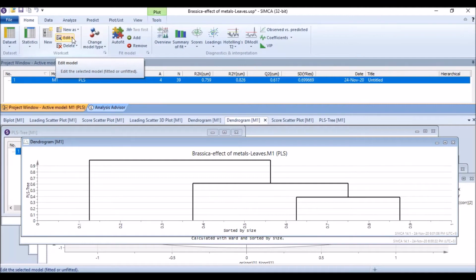Some metals concentrations, and then studied the change in metabolomic profiling of brassica through NMR, and then bucketed that NMR data for PC analysis. Then I developed myself a mock data. It's not the real data for antioxidant activity and DPPH scavenging activity. Our NMR data is the original one in this example.